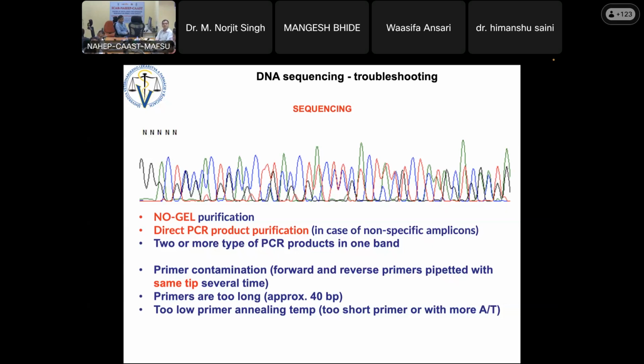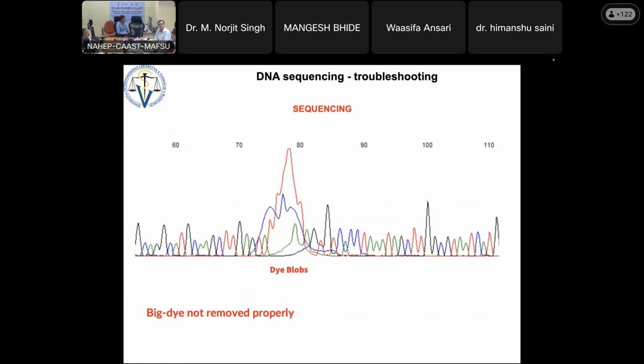You can sequence only by one strand if you want; sequencing by both strands is only to confirm. If you say I want only reverse, you can send only reverse. They need only one primer. So fortunately this is not your issue or your problem, but a side of the company.